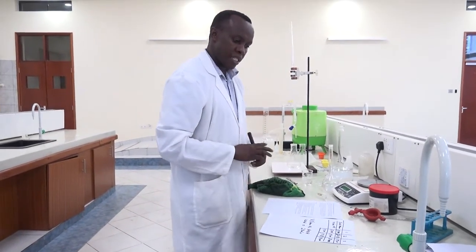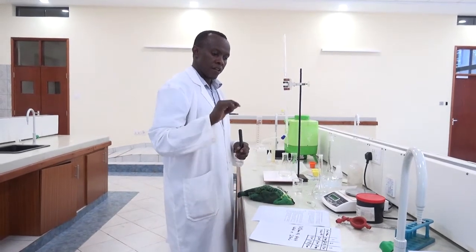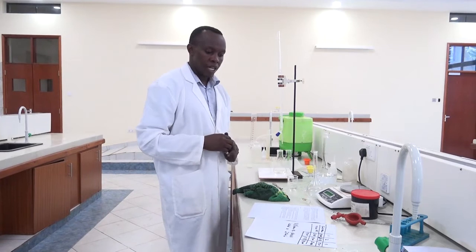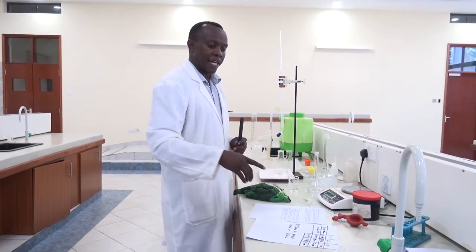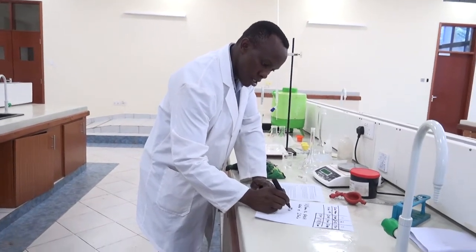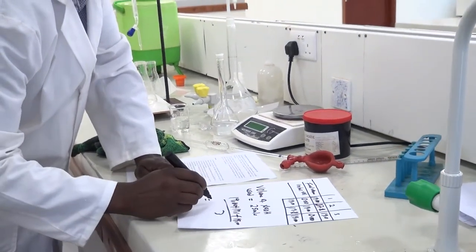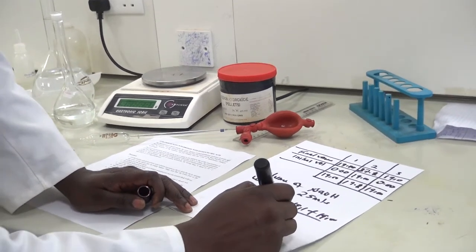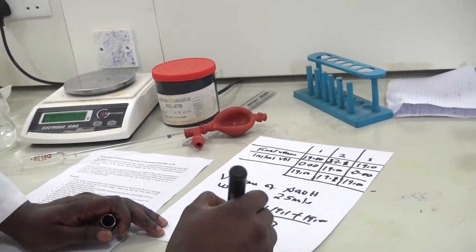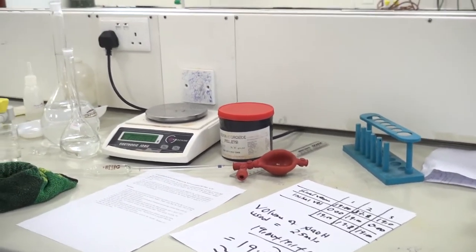I have my titer values, the first value is 19.1, 19.0. So you find that the values are within range, they coincide with one another. Now to get the average volume that I have used in my titration, I'll have to average the three titer values, because they are close enough to be averaged. I'll add the three, 19.00 plus 19.1 plus 19.00, divided by 3. So my titer value will be 19.03, which is approximately 19.00 mL.